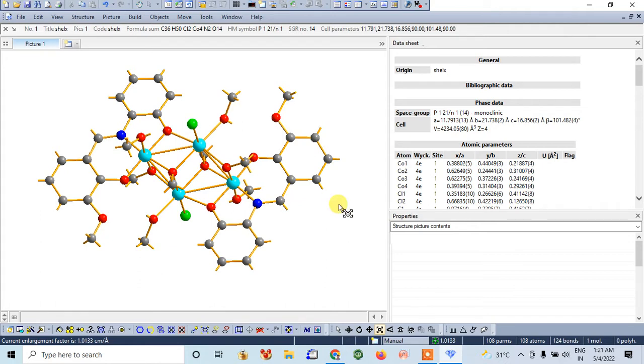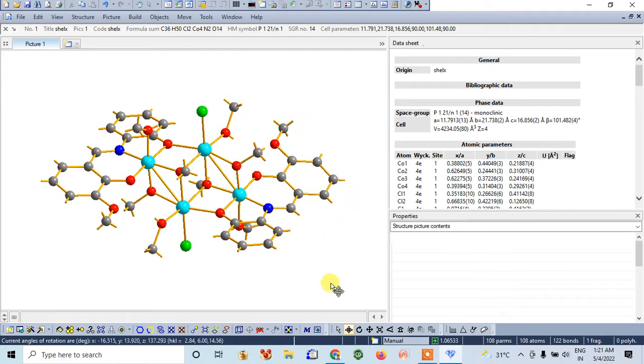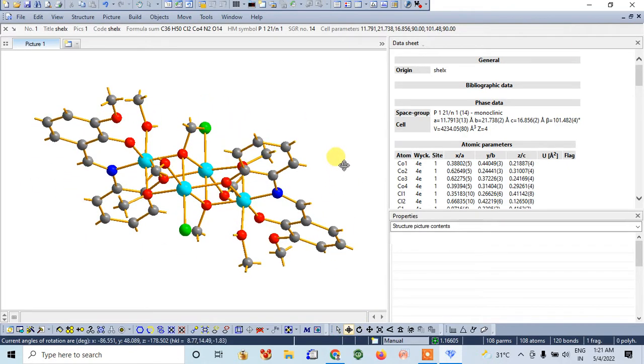So before I go for the editing of all these things, I would like to remove some unnecessary bonds from here. I will select and delete. Okay, so I have just deleted unnecessary bonds from the molecule. Now, while making beautiful pictures for the manuscript, we generally do not keep hydrogens in there. So we simply delete hydrogens. In the caption, we generally write hydrogen atoms omitted for clarity.